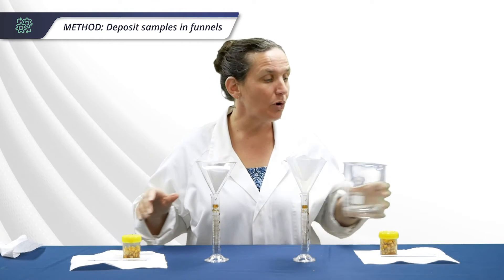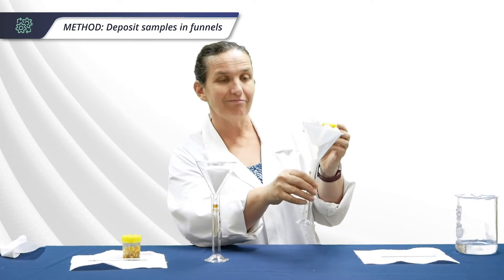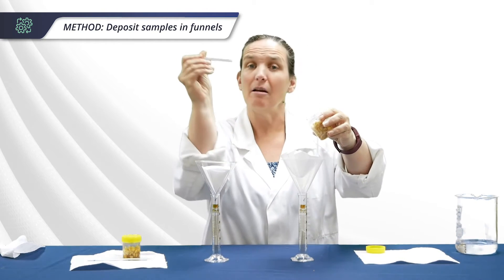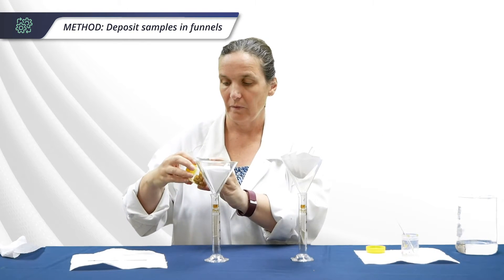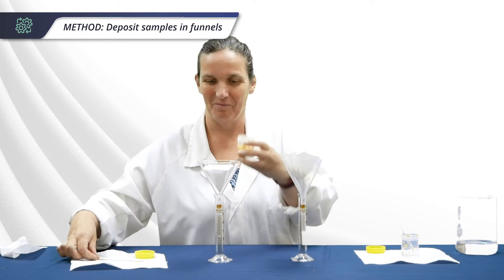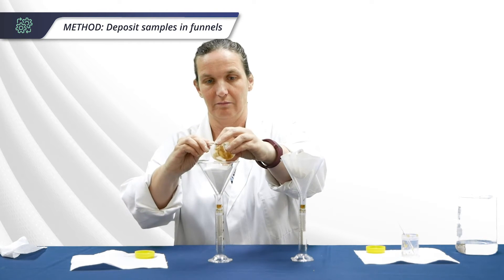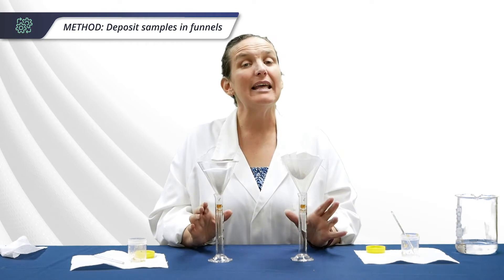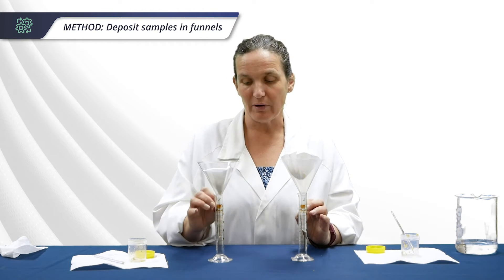Next, empty the appropriate sample into each funnel — control into control, and experiment into experiment — using the corresponding glass rod. I can already see there's a lot more juice in the experiment one. Now let them filter through for 15 minutes and come back to compare the volume created by each.